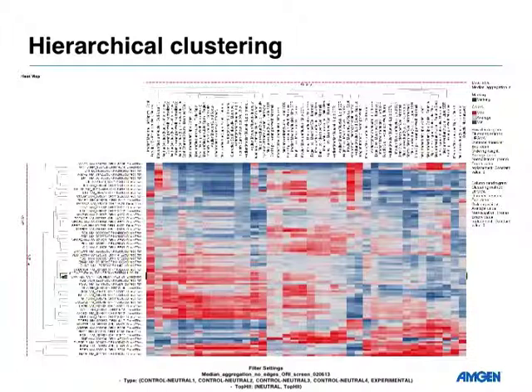This is actually fairly informative. A lot of these particular measurements are showing the same characteristics. They are all measuring the same type of thing. It might be that this is a group of texture features of the mitochondria, and one measure is basically as good as another because they're all telling you the same piece of information.